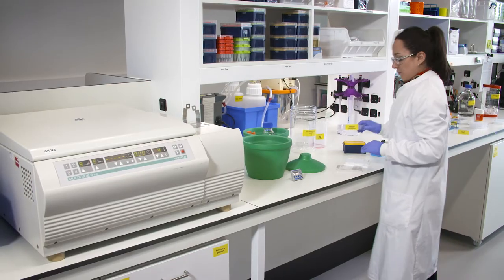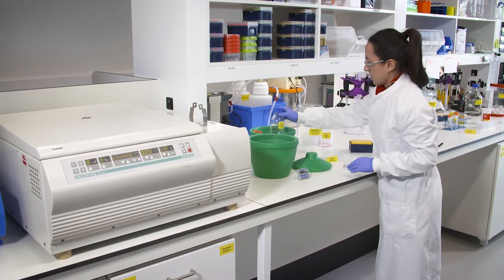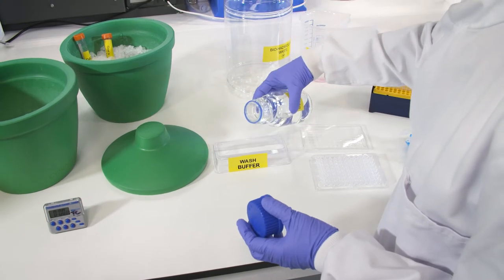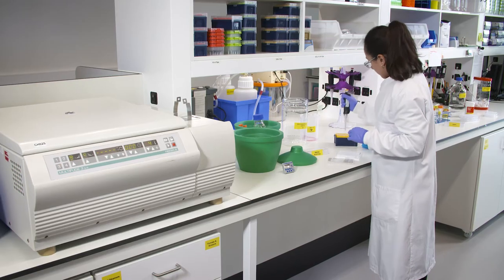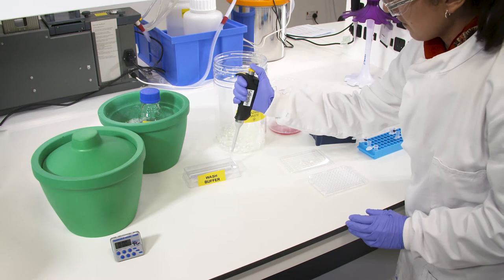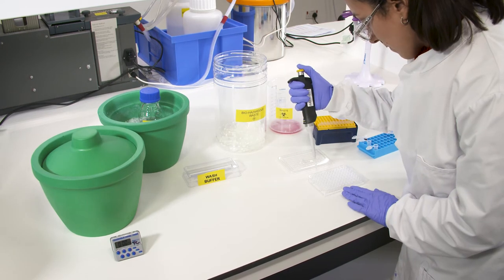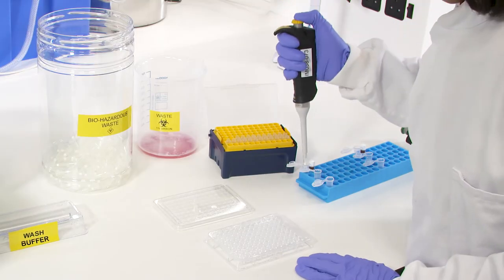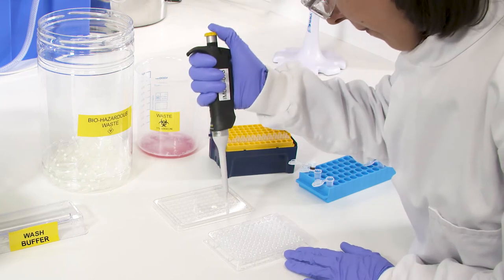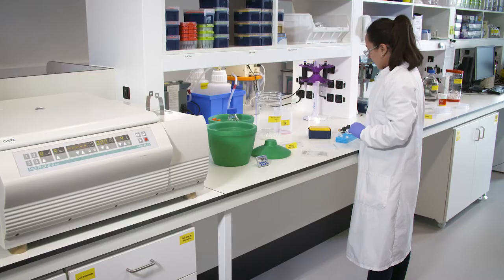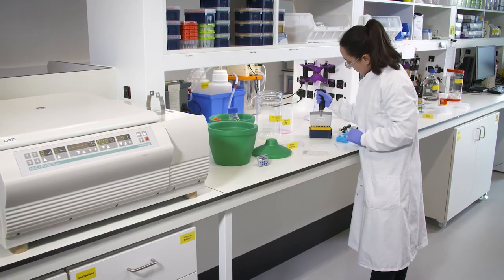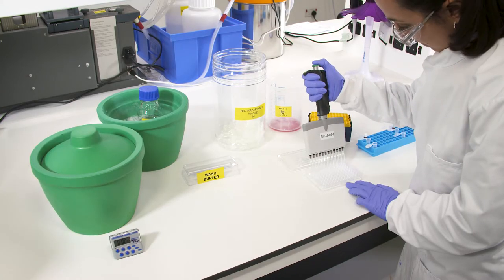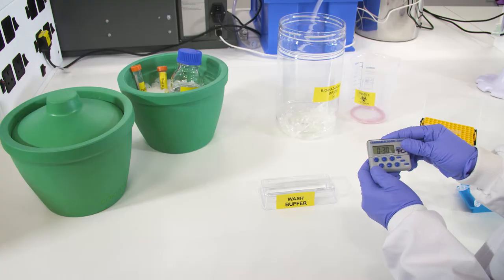Add the diluted antibody solutions from the first step to the corresponding wells. To keep the unstained control well free from antibodies, add wash buffer instead of the antibody solution to this well. Resuspend all the wells to ensure the cells are in contact with the antibody solution. Incubate for 30 minutes at 4 degrees Celsius in the dark.